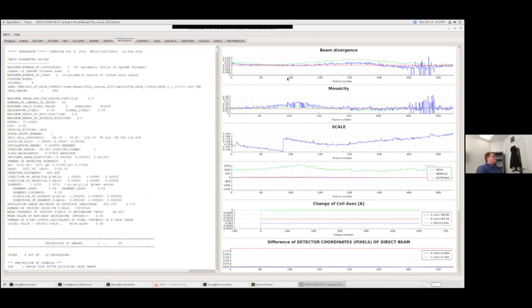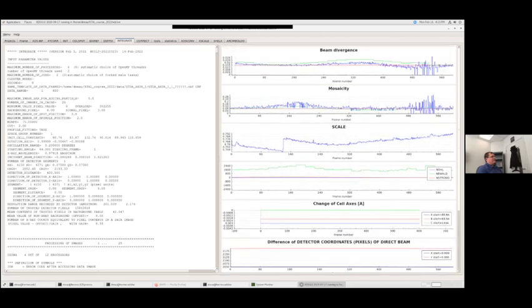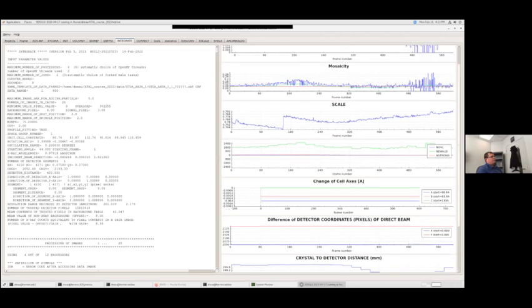On these, you've got to be careful because using the mouse will move things around. If I left click, I can drag it either way, up and down. If I use the scroll wheel, it will zoom in or zoom out. A lot of times I'm trying to scroll the actual window, thinking I'm on the scroll bar on the right here.